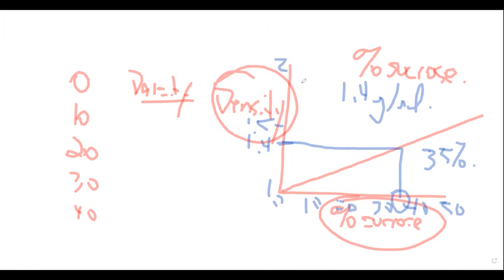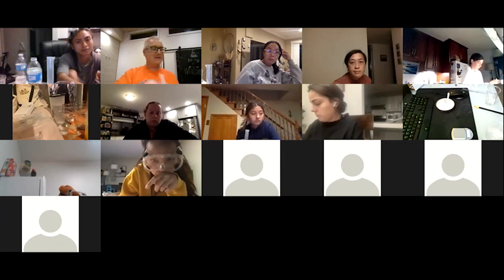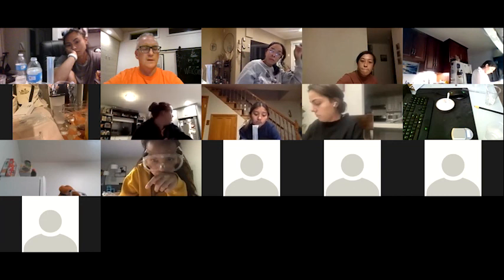So is that clear for everybody? I can hang for a little while longer to answer questions. I just want everyone to be clear on what it is they're doing. All right, so where is everybody? It's basically just mass and volume, right? And then using those two values to get density, correct? That's all we're doing here.